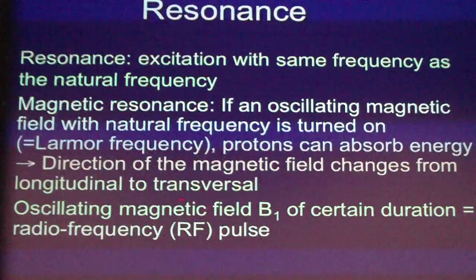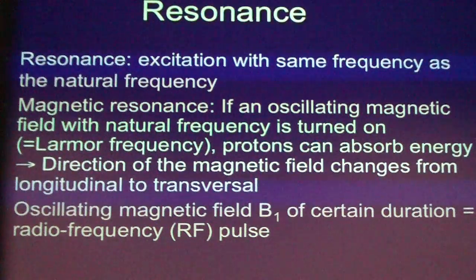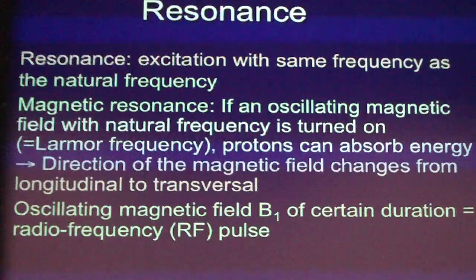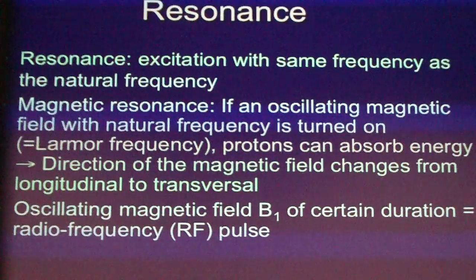So by choosing a certain duration of the pulse, we can get it in the perpendicular plane, and then we have a 90-degree pulse, as we see. If we take it longer, we'll again go out of the plane.